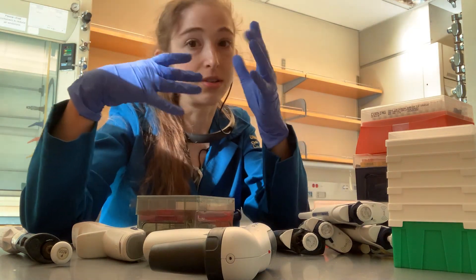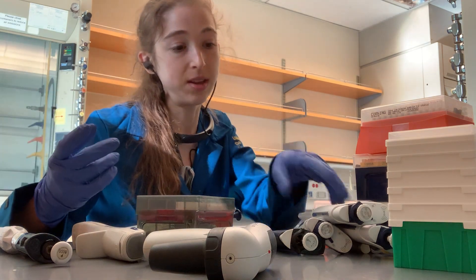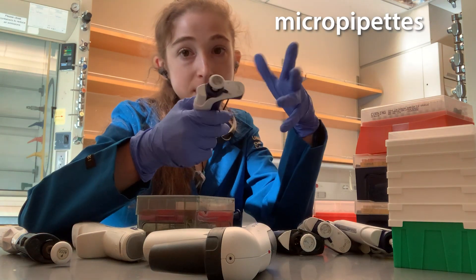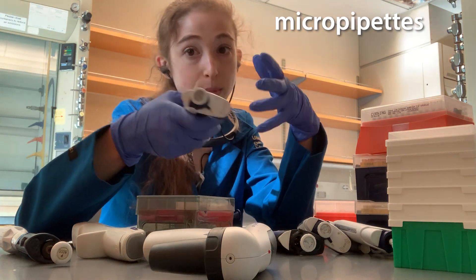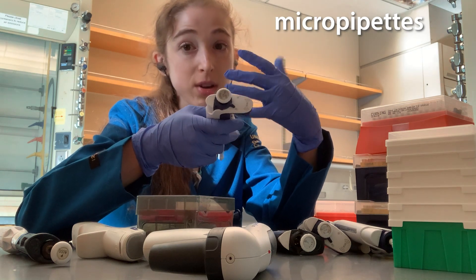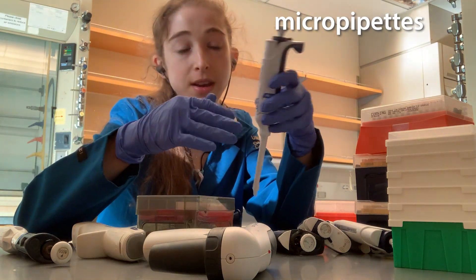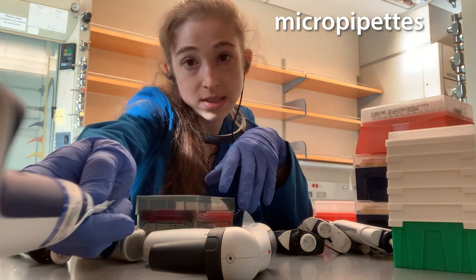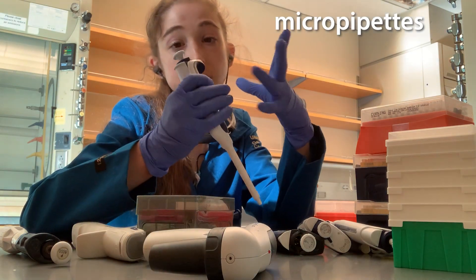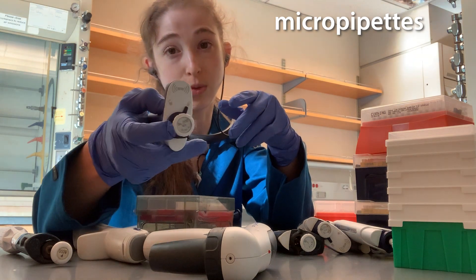With any of these pipettes, you're also going to have options about the tips. The tip sizes are going to depend on the size of the pipette. We typically refer to these pipettes in terms of the size of their biggest volume. So this one says 200 — we would call this a P200, which means it can do up to 200 microliters in volume, between 20 and 200.